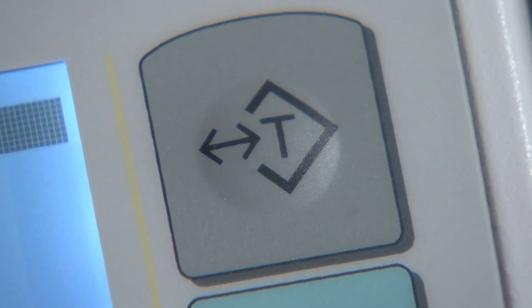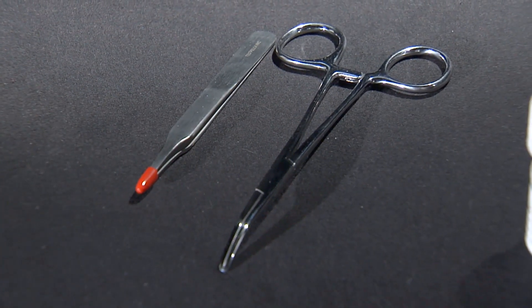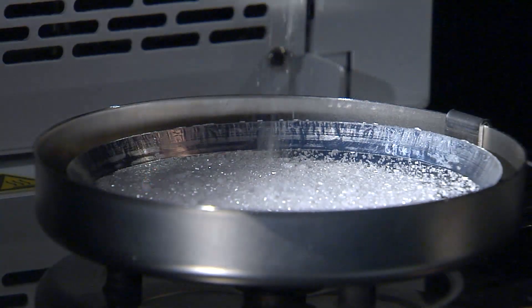Each unit is furnished with a set of disposable pans, as well as tweezers, forceps, and a microspoon, which are helpful when handling the drying samples.